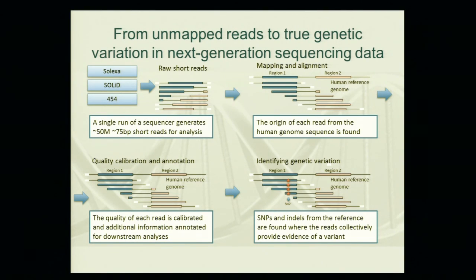So it's really a very, very long and complicated process. There is one other thing to flag. Most technology now is paired end sequencing. This is also confusing. It's like, what the hell is that? Well, really, when you do that sonication thing, you break it down and all that kind of stuff, the idea is that you actually try and sequence from both ends of the DNA fragment that you've isolated.